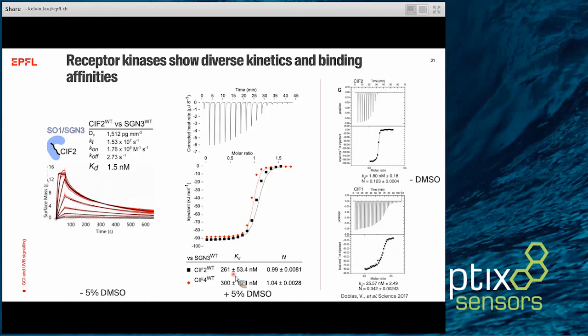But I think this slide highlights that even if you have one technique in-house, it's not that bad to try something else to confirm it, especially if you have different conditions. Also, for many scientists I know that are listening here, you can trust your data, but always be aware that the conditions of your experiment can drastically change what you measure. So don't worry if your measured affinity constants are different than what is published.